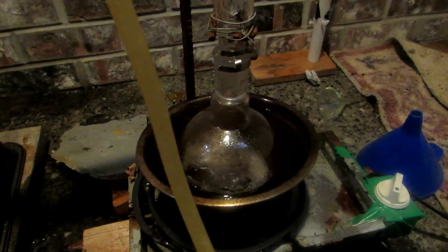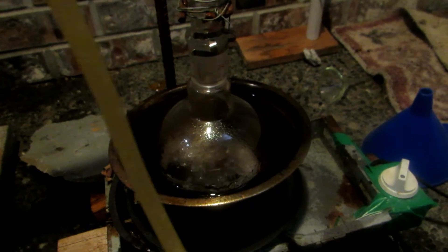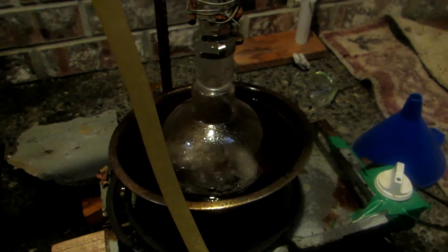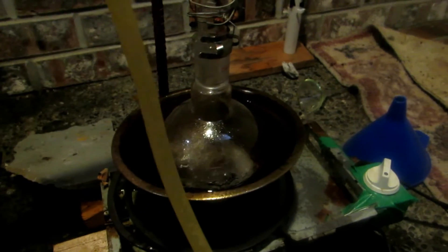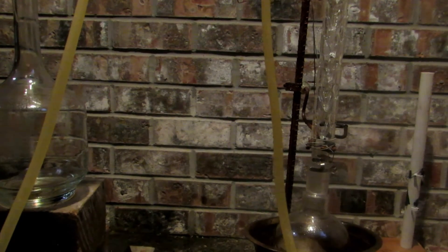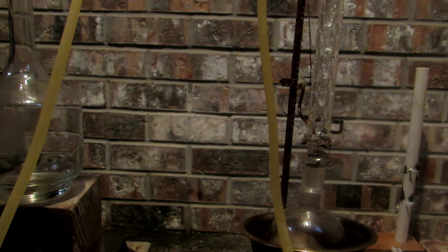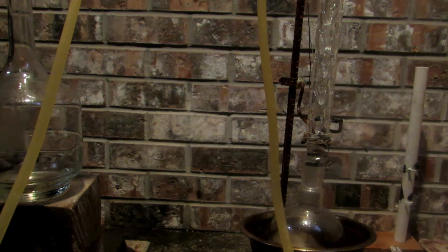It should be noted that all of the polymer that was holding the gel together has come out as a very thick, viscous substance. I really hope I can get it out of the round-bottom flask, but I want to collect everything from it. The temperature is currently at about 50°C, so as soon as it hits 65°C I will swap to another receiving flask and collect the methanol layer.